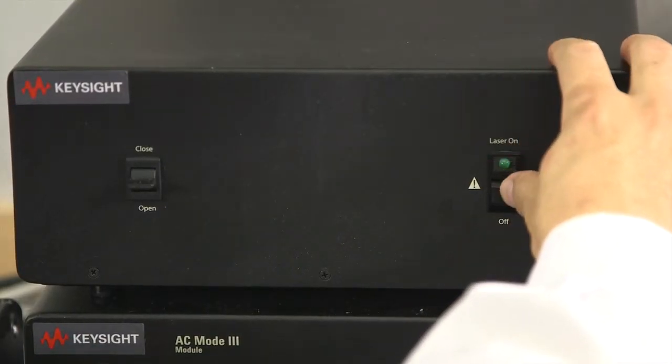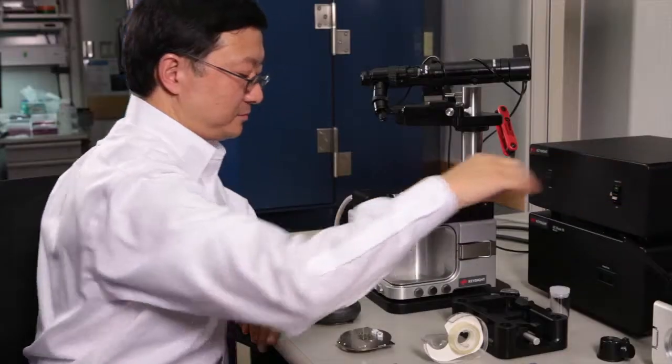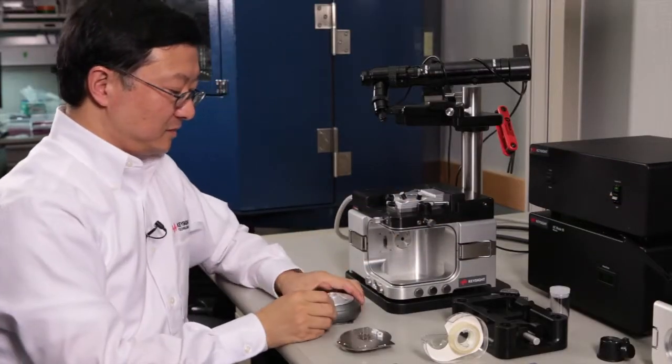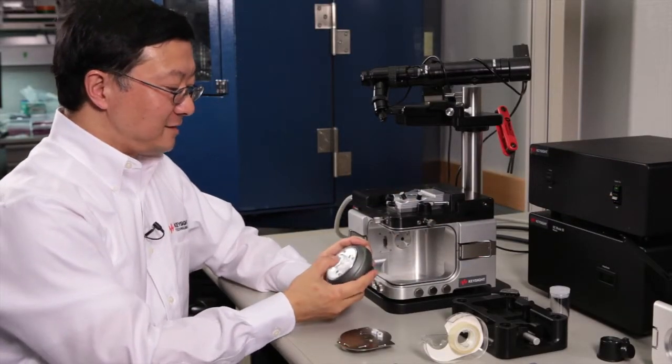Turn on your laser power. Turn on your LED light.